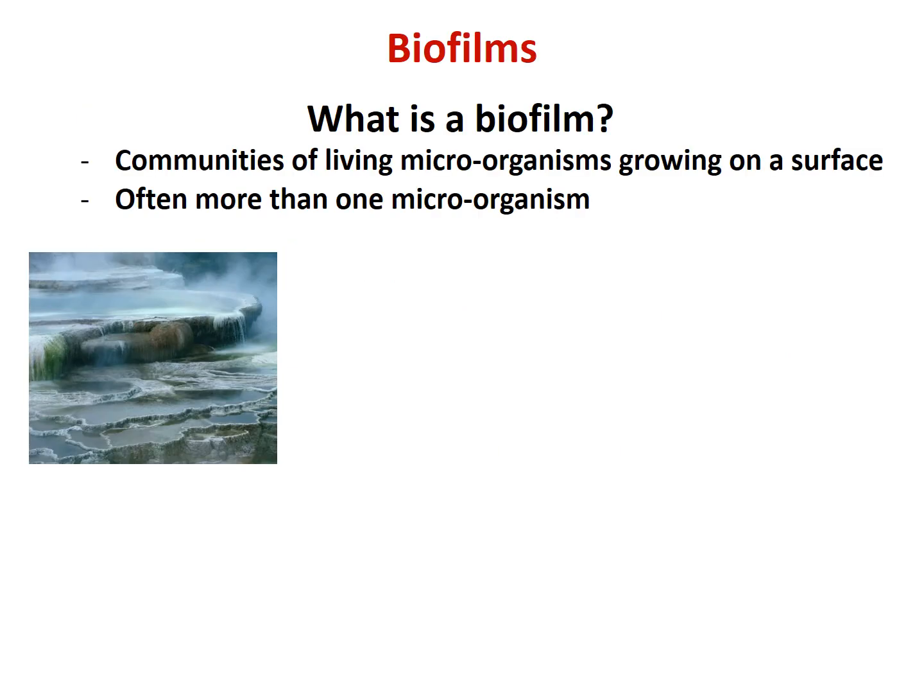All right, so we'll start out with biofilms. So what is a biofilm? Biofilms are simply communities of microorganisms that grow on a surface. Now, you can often have more than one microorganism in a biofilm. What we're going to work with today is a single organism in each biofilm that we form. But they grow, you can see here, in aqueous environments. So we can see the organisms just growing on these rocks, and there are microorganisms there also.